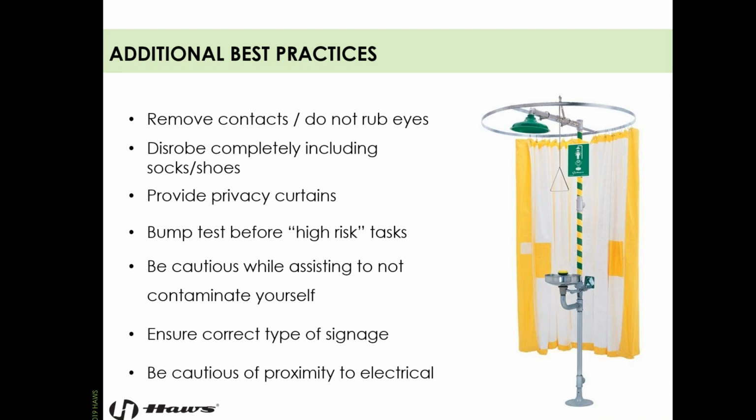Be cautious while assisting. Be cautious while assisting to not contaminate yourself. Give them verbal cues if you're assisting a coworker on how to get there.